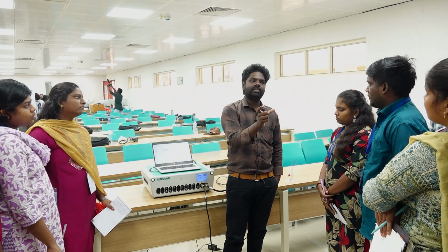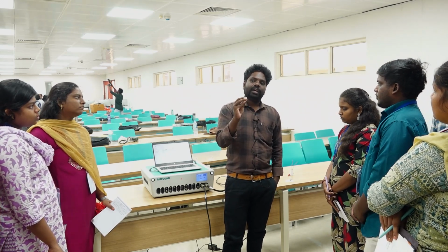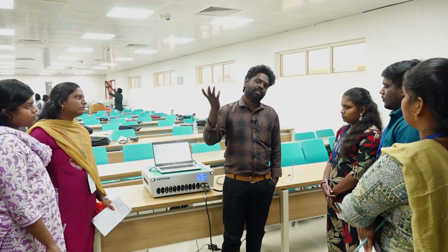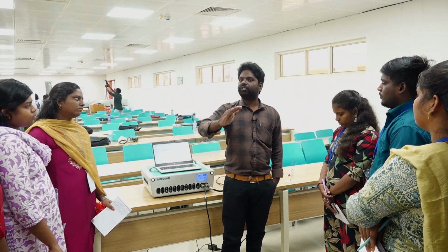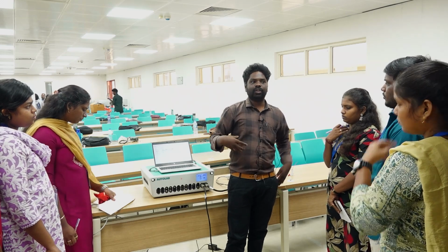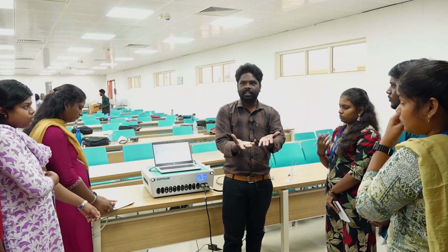By default your sample has some minimum resistance, or solution resistance, that is internal resistance. Charge transfer resistance is this: if you are applying some input to your sample, either current, voltage or frequency, your material has some minimum resistance to oppose our input. Every material has resistance, and we are trying to disturb the material. So every material, at least at some minimum level, tries to oppose our input, because every metal has its capacity. That resistance is charge transfer resistance.